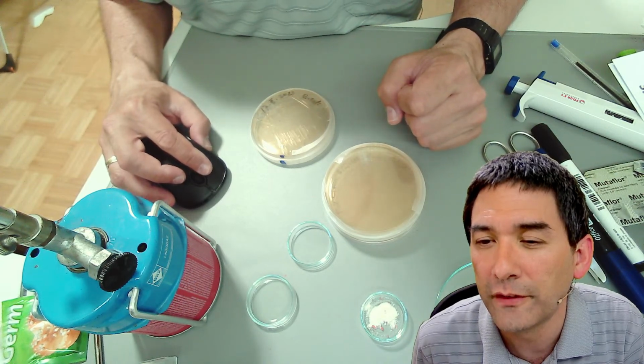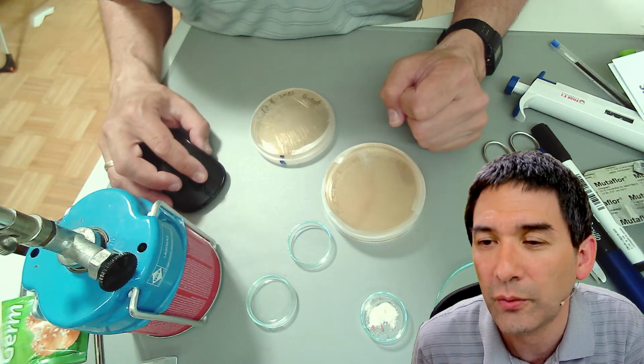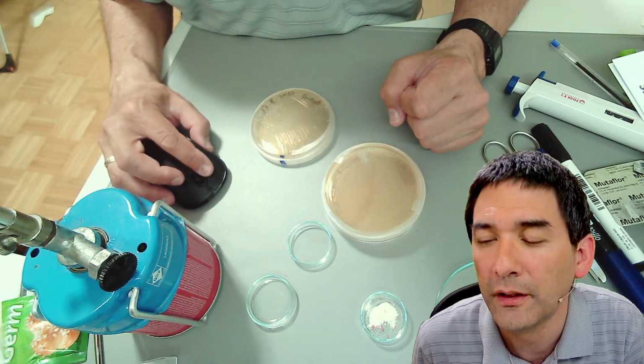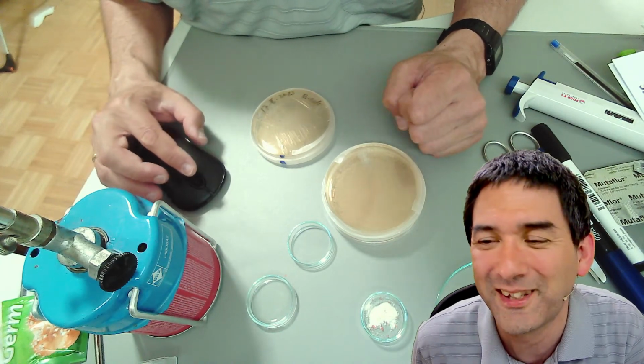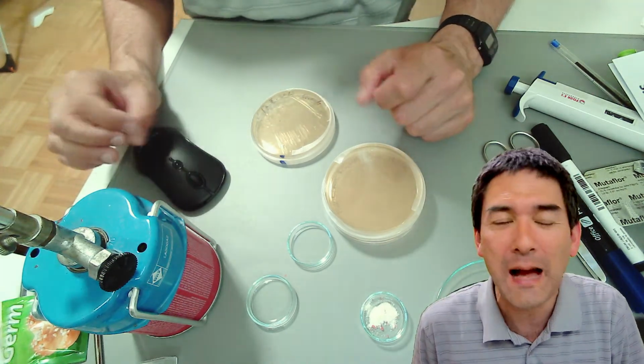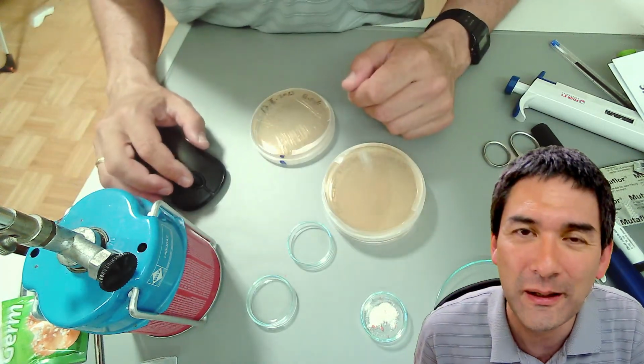Can you send photos of the parasites, bacteria, fungi? I have great photos. Okay, I think that's meant for someone else. I thought you said that bacteria were boring, put under the microscope. I think so compared to the others. And also, I don't have an inoculator tube either. Yeah, I personally consider bacteria not so interesting considering the other things that you're all able to see.